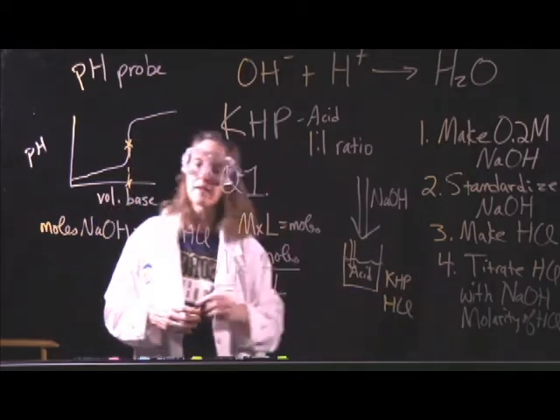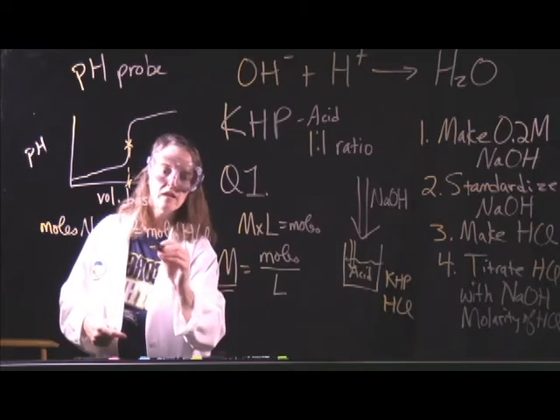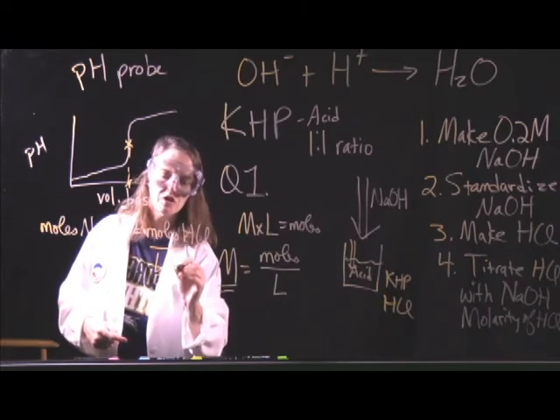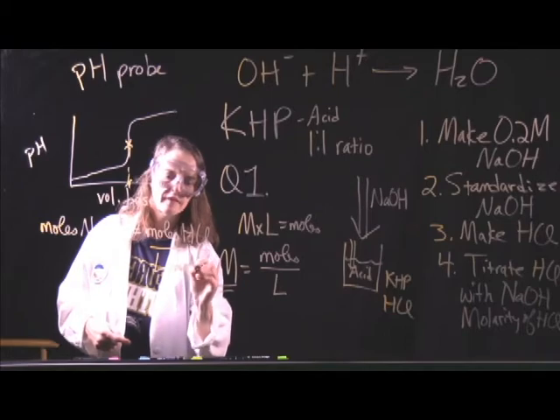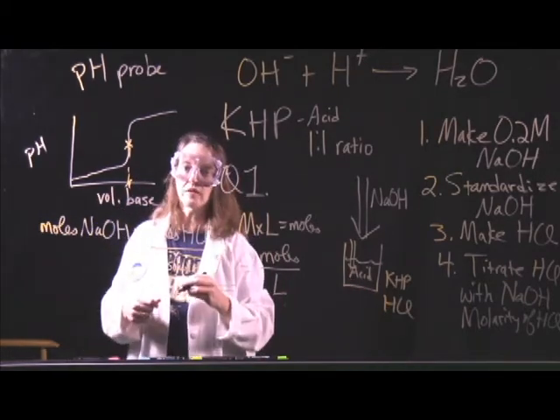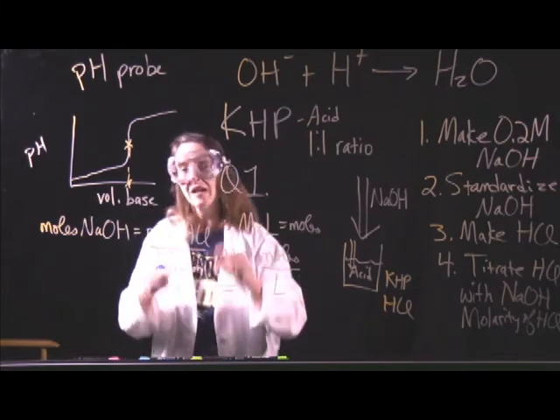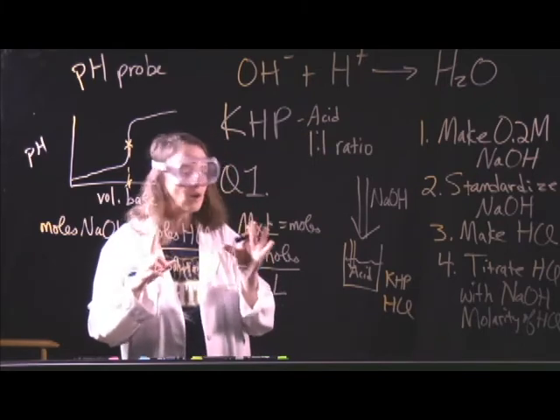To find the molarity of the HCl, you just take your moles of HCl divided by the liters of solution of HCl, and that should give you the molarity, and that should be everything that you need to know. Time can be a problem in this lab.